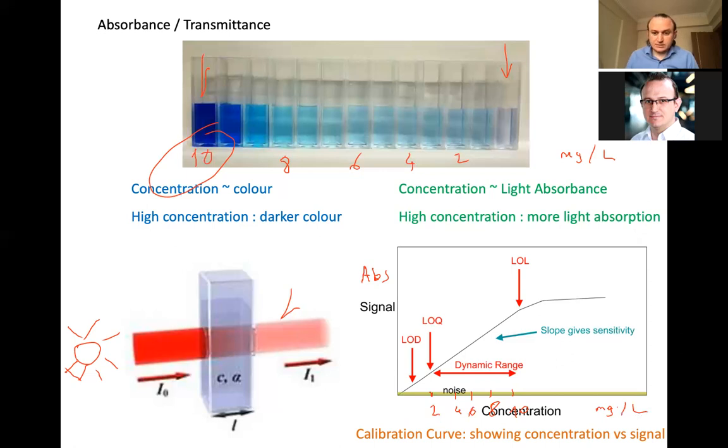So if I measure the absorbance for these known concentrations, I can find the data like this. And if I just plot a line which is fitting as good as it gets, I mean, to these data points, you will get the hopefully linear or nicely fitting calibration curve, which will have equation like y = m x + n.